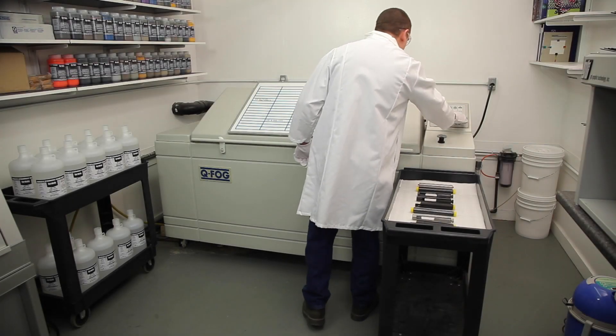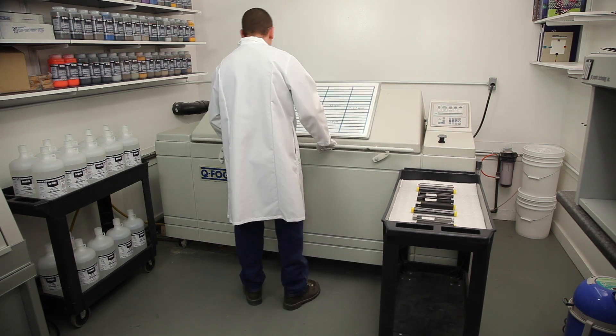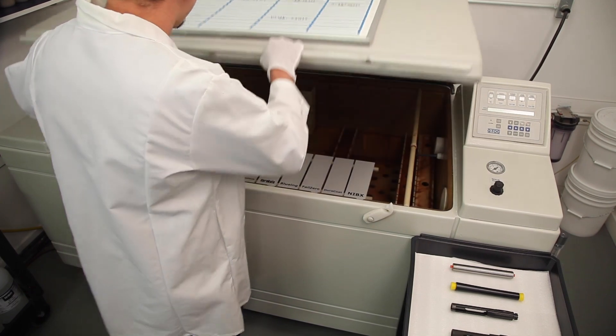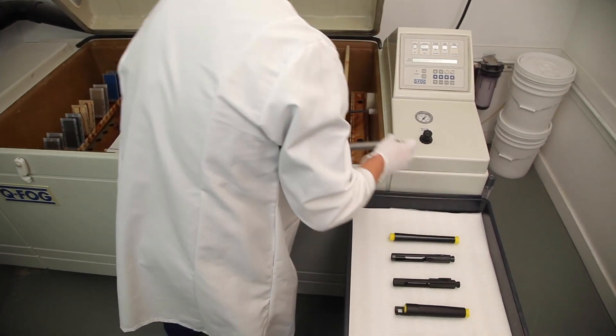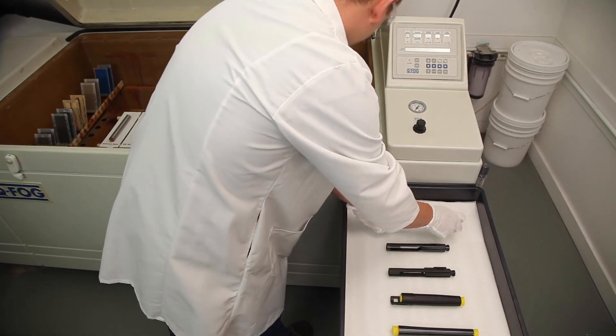Salt chamber testing is used to draw a comparison between metals and finishes and does not correlate to a specific number of hours of real-world use. Nine firearm components in total are placed into the salt chamber to see how long it takes for each finish to show initial signs of corrosion.